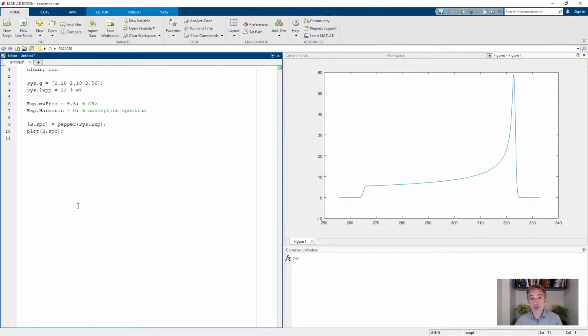So the second difference to the liquid state is that now we need to sometimes take into account different broadening mechanisms. We actually have to think about the physics behind broadening. So in a frozen solution of, let's say, a small complex, in our case this nickel complex, when you freeze them, and the nickel is coordinated by some ligands, the freezing will result in strains and different solvent crystallites that push and pull on the ligands.